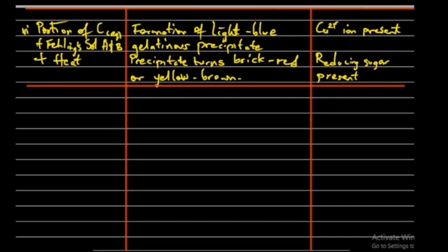Next test we carried out was using sodium hydroxide and Fehling's solution. A portion of C plus sodium hydroxide first.